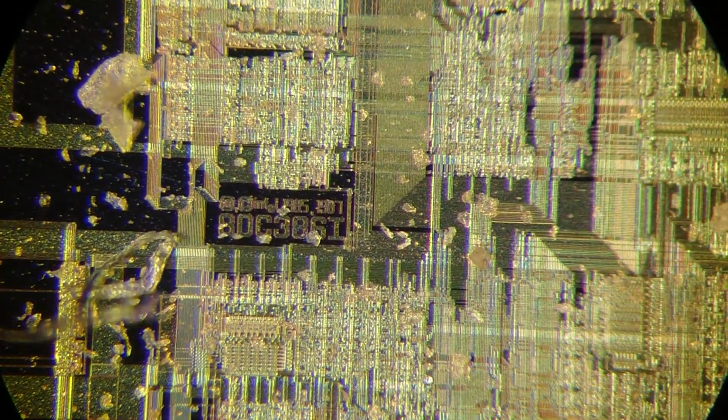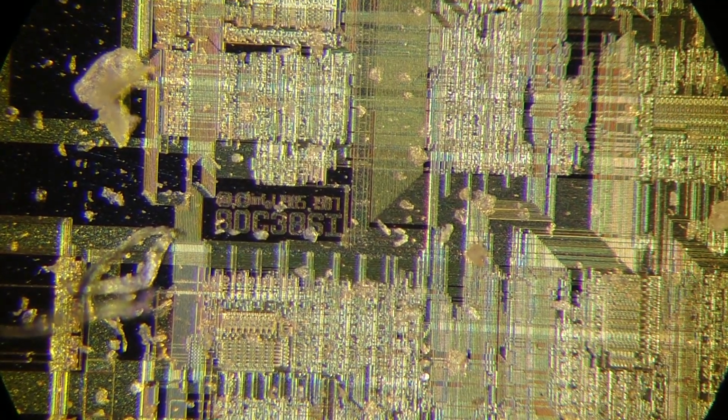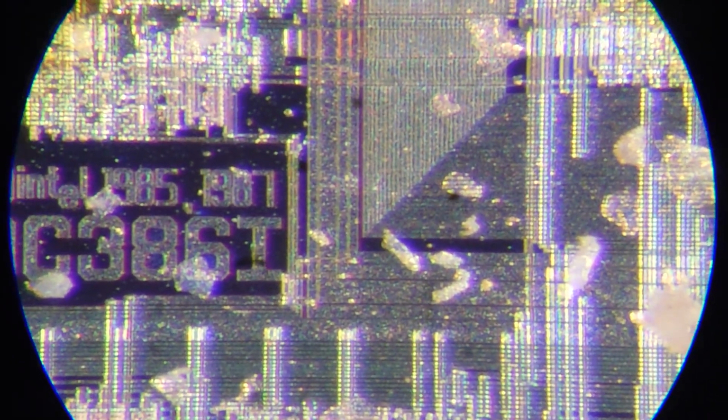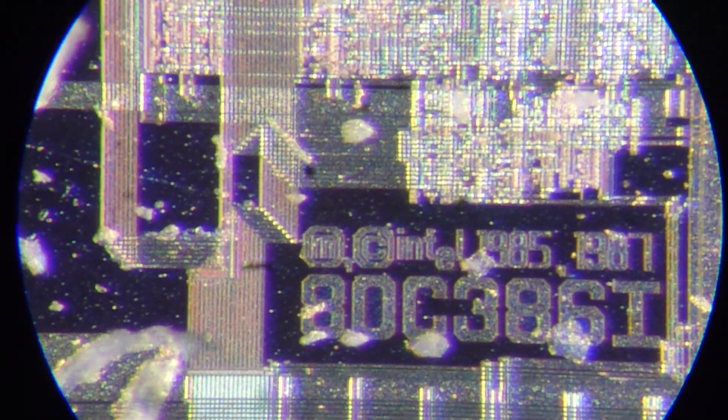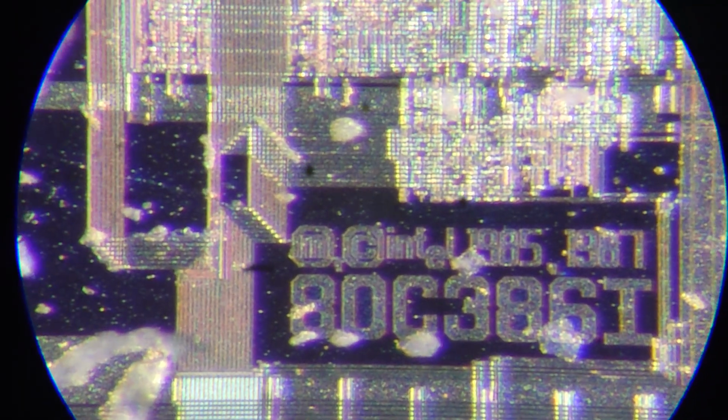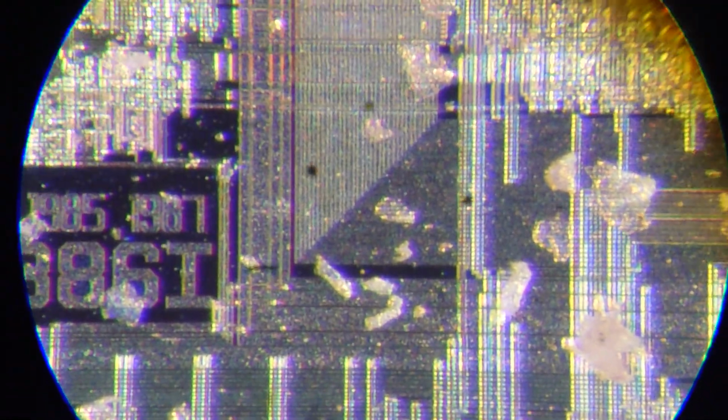With 10x eyepieces, I don't see much about resolution. Let's switch to our 30 times eyepiece. And now I guess we can easily see the structure of this bus of conductors. Yes, I see. I guess everybody can spot it easily. And we have technically 2 sizes of conductors. Those on the left are 50% bigger, and the pitch is 50% bigger. So technically those conductors are seen with every microscope, while those are seen only with a few.